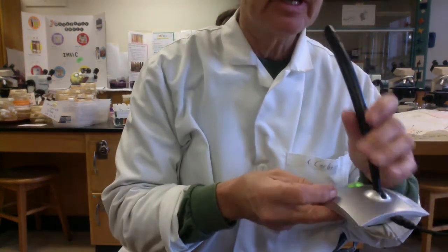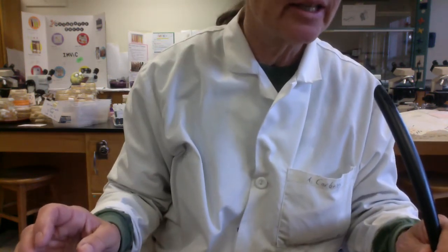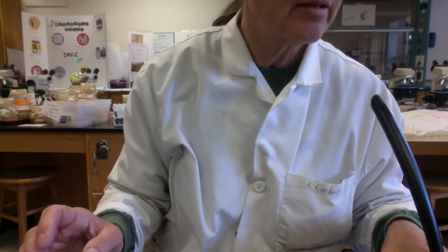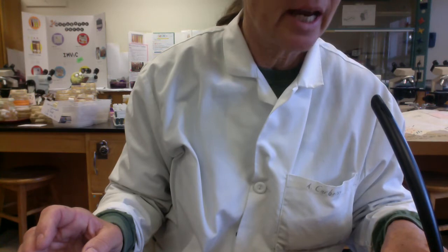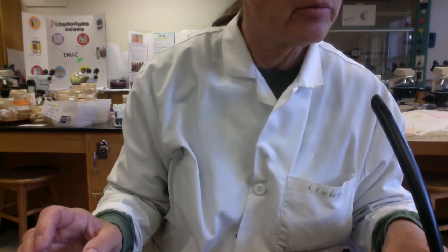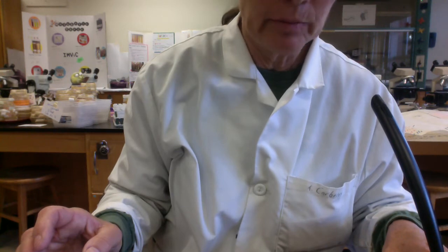Hi, micro folks. This is a short little movie discussing our airborne microbe experiment. This was in chapter 10, microbial growth media. So this is to demonstrate that microbes are everywhere, even in the air we breathe.